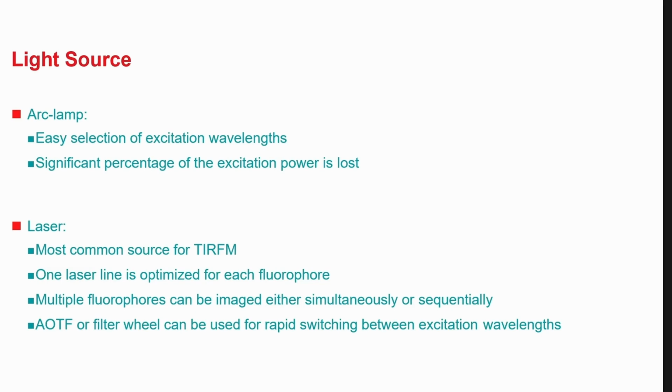And what I wanted to add is that sometimes the most useful application of TIRF is not by itself, but in combination with other super resolution methods. And why this is important, as you will see in a minute, is that many of these methods, for example STED, unless you have a second donut, an axial donut, only increase resolution laterally, not axially. But if you combine it with TIRF, you immediately get a very high axial resolution. For a thin layer, yes, but still it is usable.